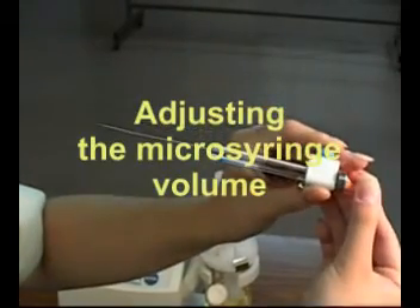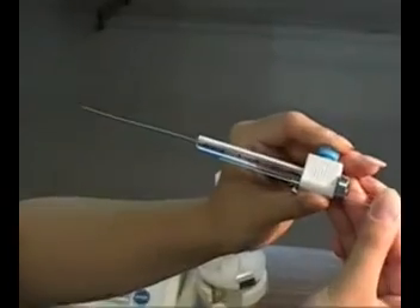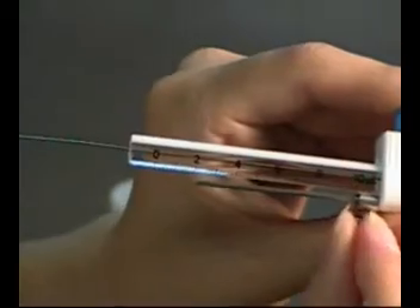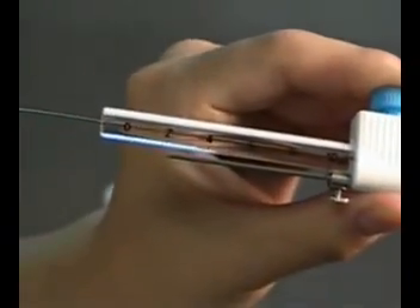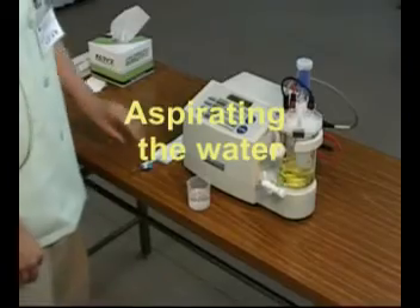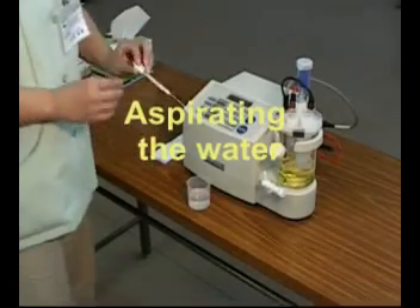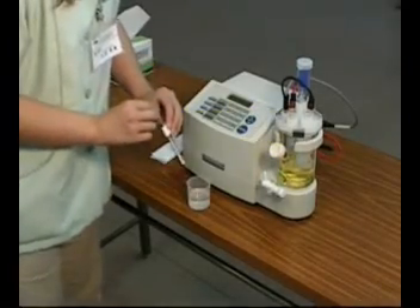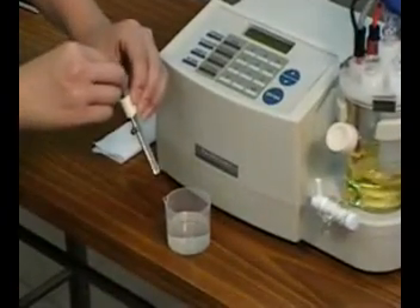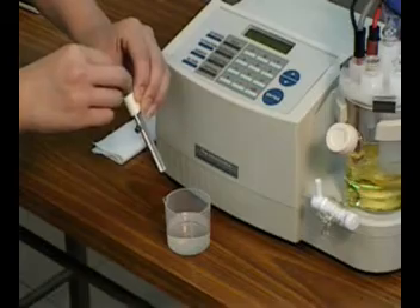Adjust the volume of the microsyringe to 2 microliters. After flushing the microsyringe with deionized water three times, take up 2 microliters of deionized water into the microsyringe.